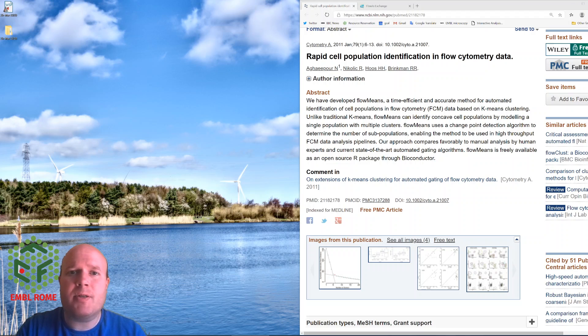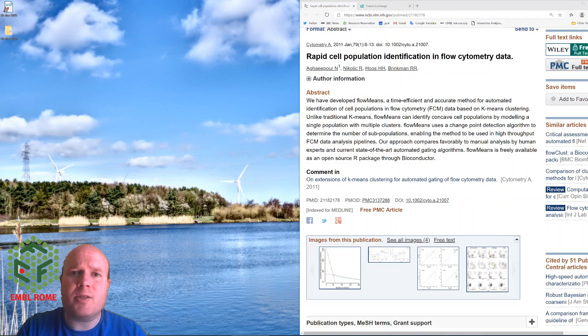Hello, today I'm going to talk about automatically gating cell populations in FlowJo software. To do this we'll be using the FlowMeans plugin for FlowJo.